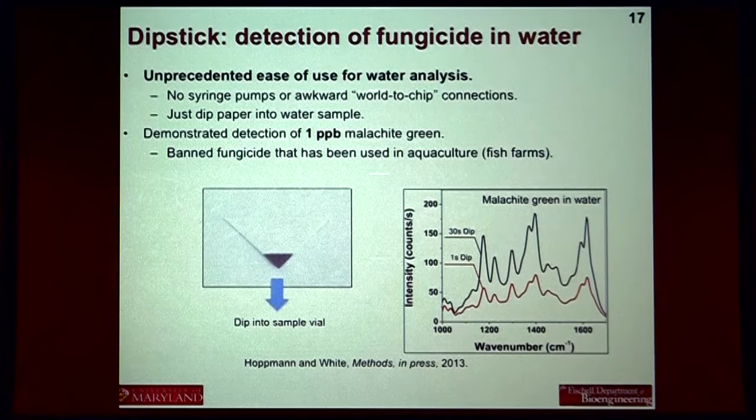Is this using your Raman spectrometer? Thanks for calling me out on that. No, I should have mentioned, everything I show here is using the newer handheld, smaller devices. We have one in our lab that is about this big. That doesn't have the laser in it, so add a diode laser to this big. Which company is this? We use an Ocean Optics spectrometer right now. We bought another one from another smaller outfit, but we started with Ocean Optics.